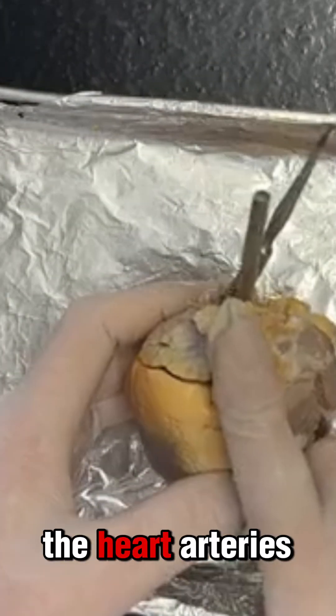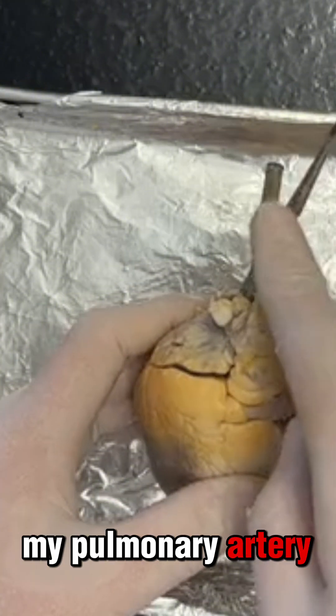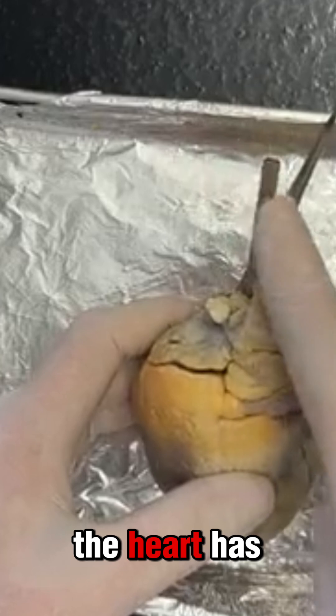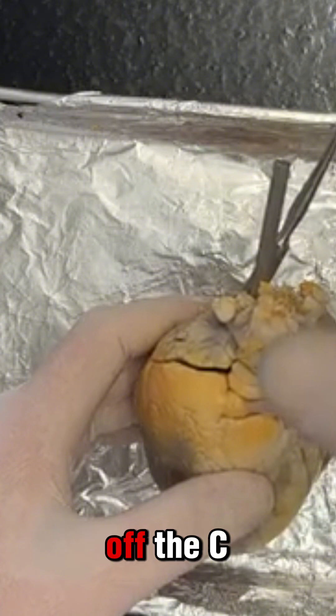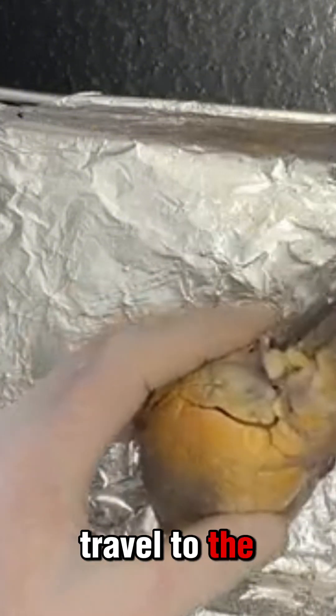The blood is going to leave through my pulmonary artery. Veins go to the heart; arteries go away from the heart. The pulmonary artery — pulmonary has to do with the lungs — carries blood with carbon dioxide away from the heart. It's going to go to my lungs, drop off the CO2, pick up O2, and then we travel to the other side of the heart.